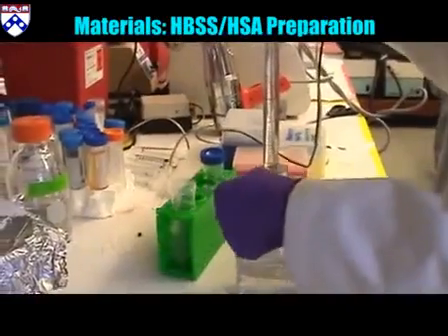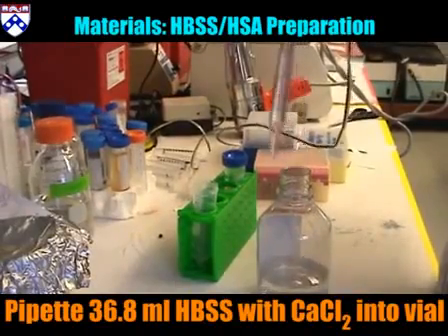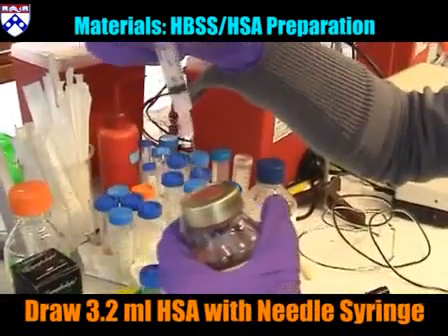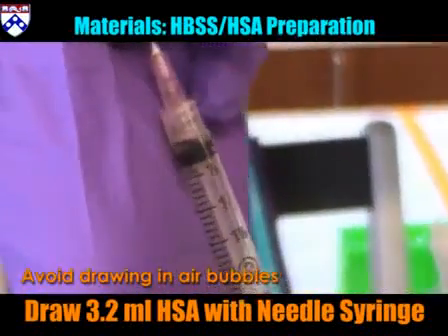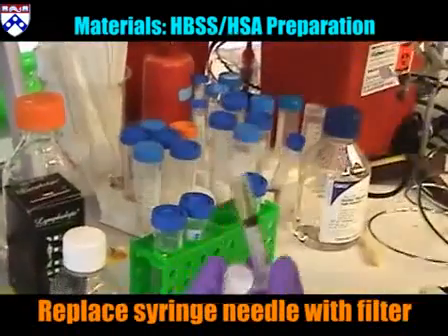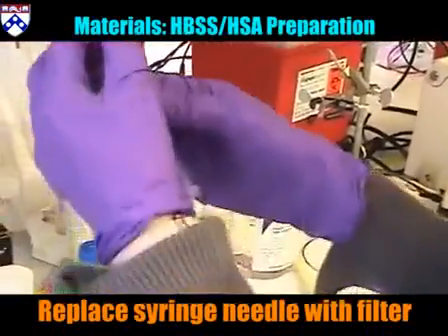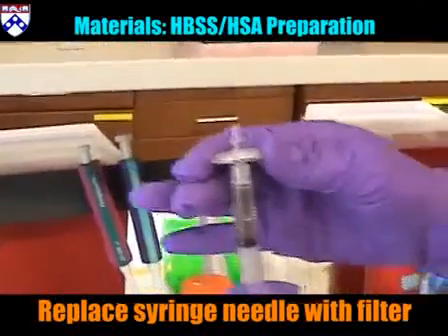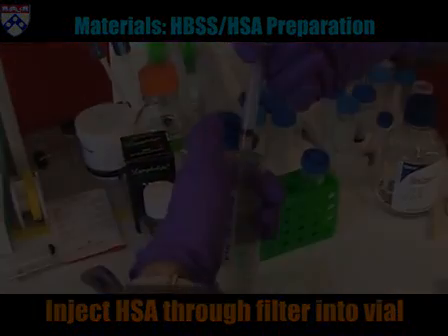Prepare HBSS-HSA solution for neutrophil separation. Pipette HBSS with calcium chloride into vial. Draw HSA into syringe, avoiding trapped air bubbles. Remove the syringe needle and replace it with a filter. Inject HSA through the filter into the HBSS vial.